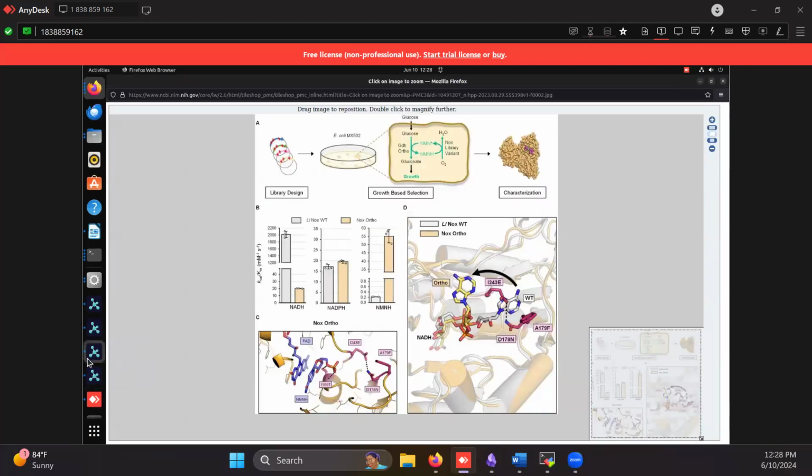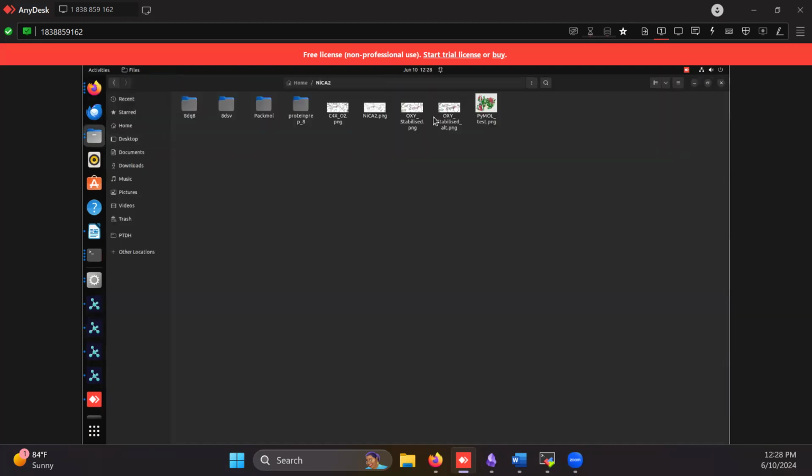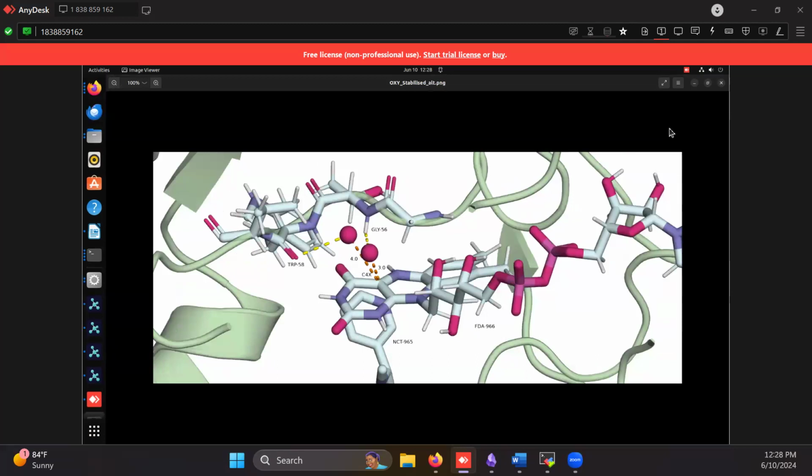I have made a very similar one. This is what I ended up with after going back and forth with different colors and different representations. Once we make this image, this is with the fog. So I went through a lot of iterations. This is with the fog. This is without the fog.